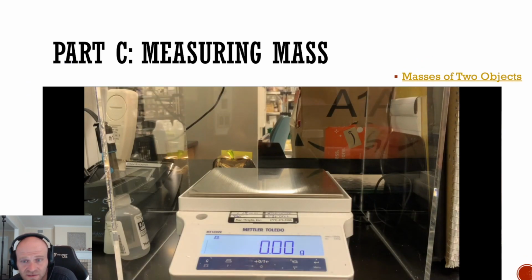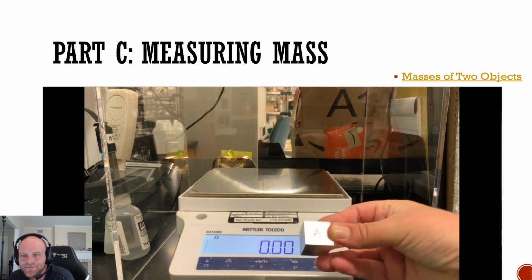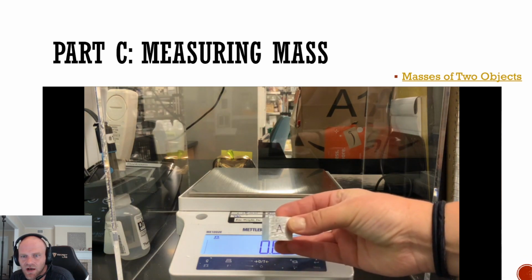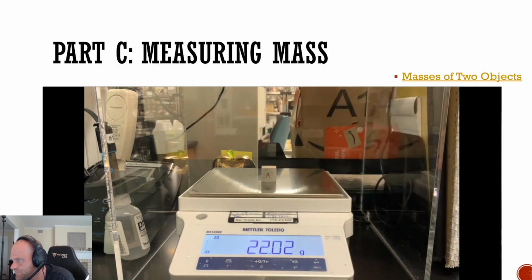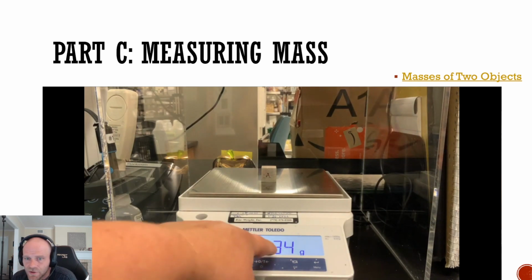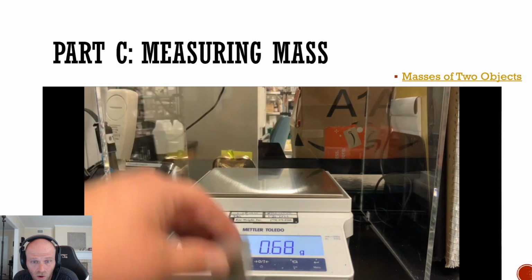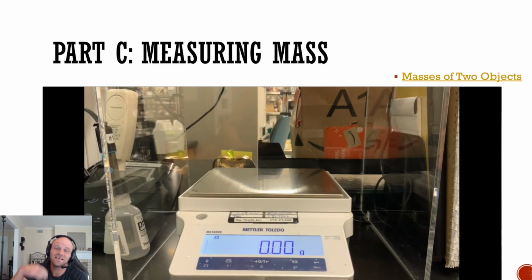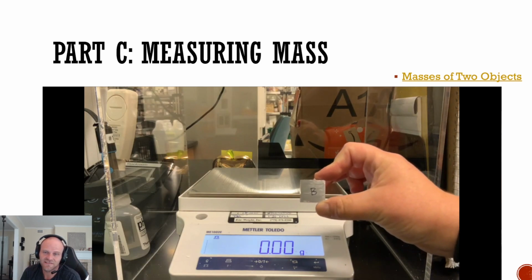She's taring the balance there to zero it out. That's called tare, T-A-R-E. Here is metal object A. So enter in that value, as many numbers as the scale gives you. Always include all the numbers, as many significant figures as possible is always a good thing in science.